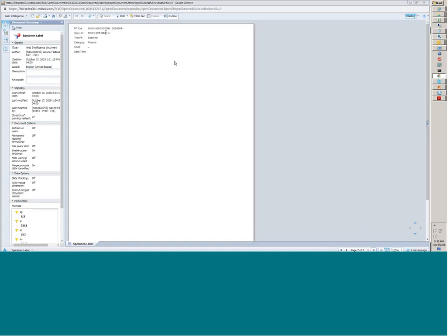Again, we see the specimen ID, the same universal patient ID and the treatment patient ID. A different specimen ID, the baseline time point, and the category of plasma. There's no codes here because we didn't enter that data in the tracking enrollment form. And we can zip back through the different labels. There'll be 4 that are the same, and then we get back to labels 1, 2, and 3 for the tissues.